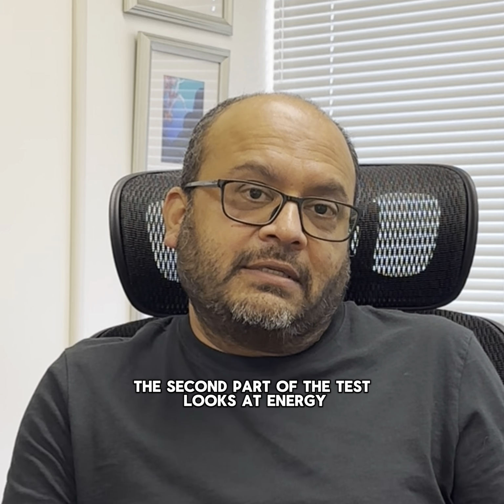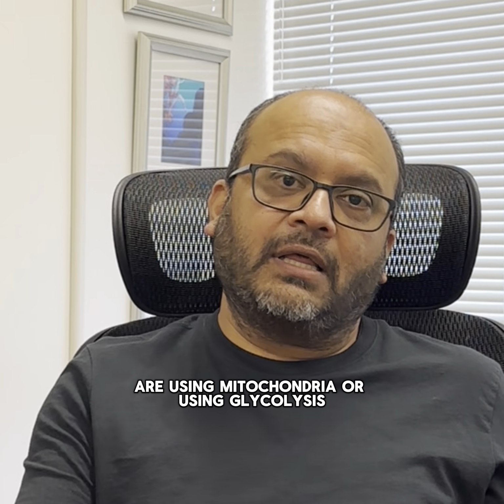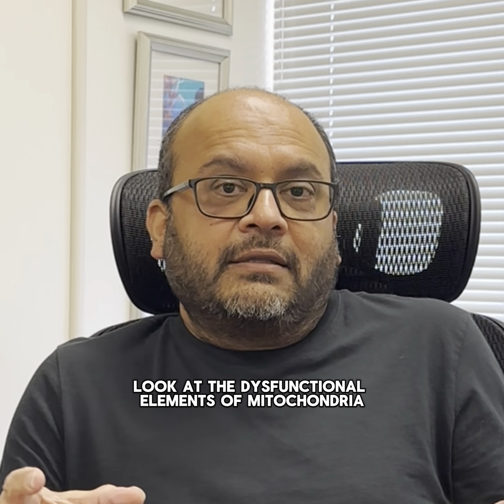The second part of the test looks at energy. How are you making energy? Are you using mitochondria? Are you using glycolysis? Is it efficient, inefficient? What is that energy state? And the two final parts look at the dysfunctional elements of mitochondria.